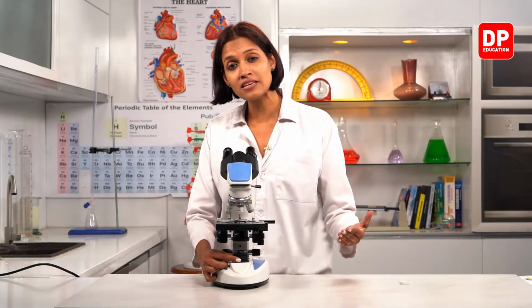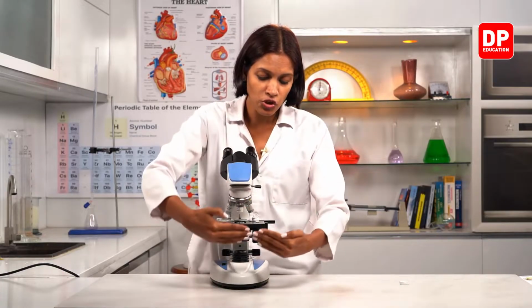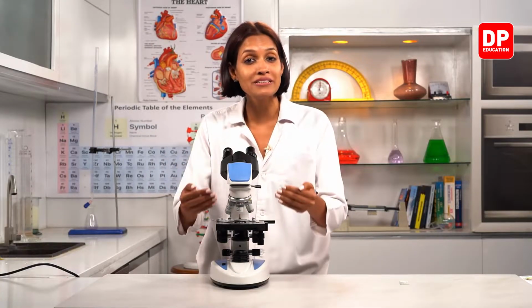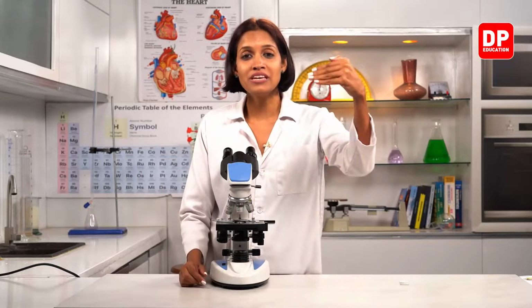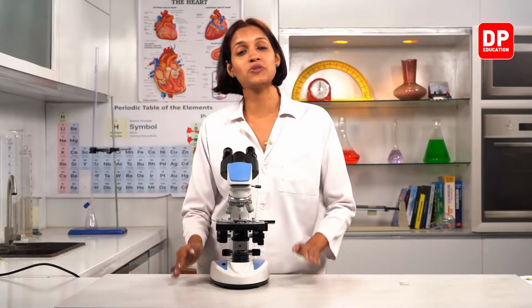But in that basic microscope, there's no light source. Therefore, light coming from the other side should be directed towards the specimen. That is done by the mirror. You all know that mirrors can reflect light. So by adjusting the mirror, by rotating the mirror, we can direct light coming from one side towards the specimen. So that is the importance of the presence of the mirror in the basic microscope.